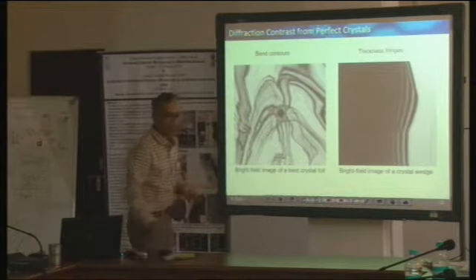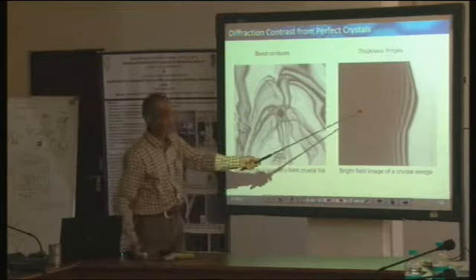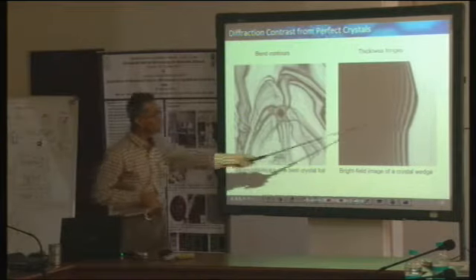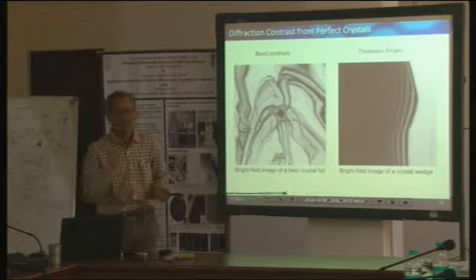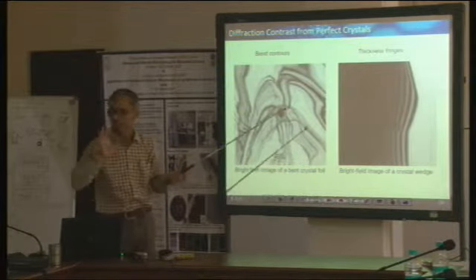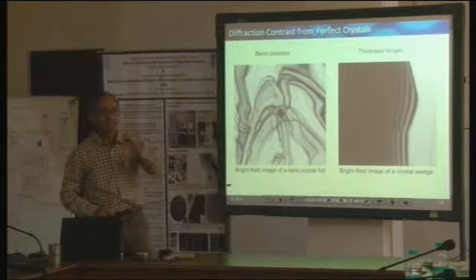And then, let us say, I go to a slightly thicker area of the sample. That's why it is also slightly darker, as you can see. Why? What is one reason why it should be darker? This is also silicon. This is also silicon. Why is this image darker, assuming that they were both acquired under the same acquisition conditions? Why is this image darker? Thickness is one reason. Now, one thing: if it is thicker, then it is less likely to bend.